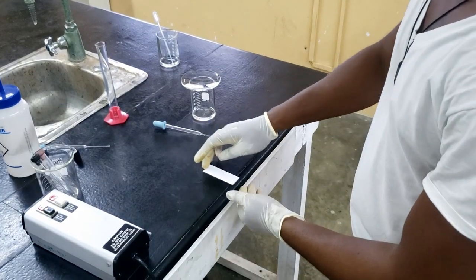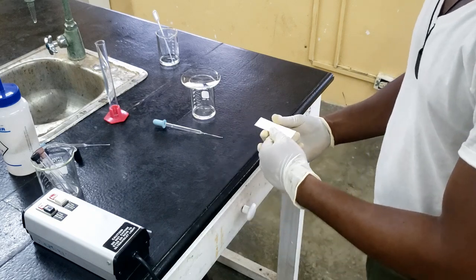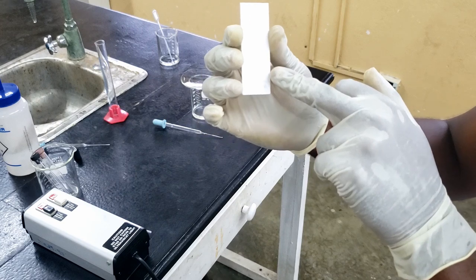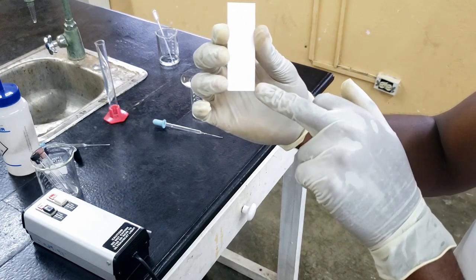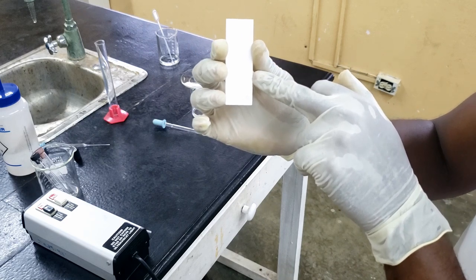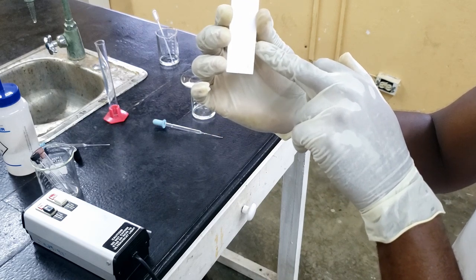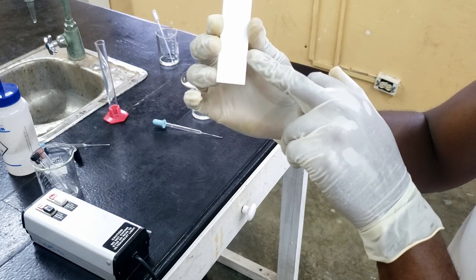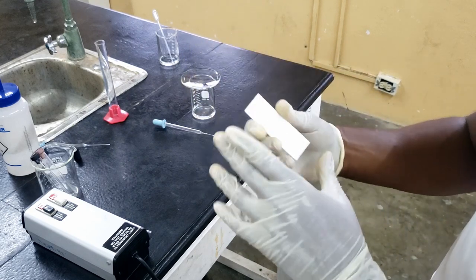Now that we've allowed the TLC plate to dry after we've taken out the chromatogram, you can see a slight yellow spot above the first initial spot that we did for the O. So that spot is 1-bromo-2,4-dinitrobenzene. That is another byproduct that we get. So that is dry now.